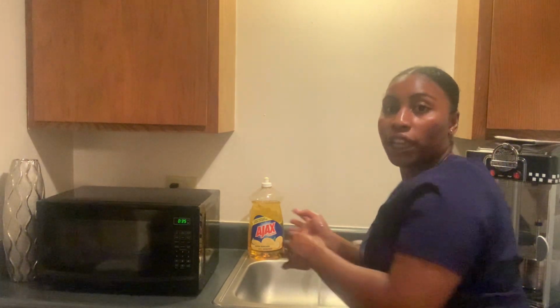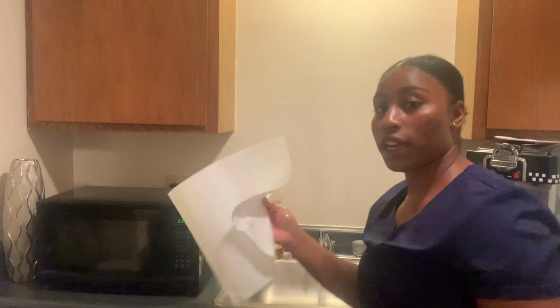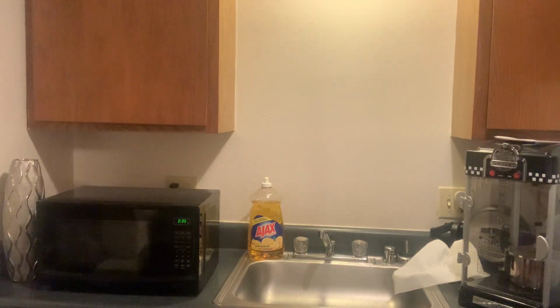Okay, so I'm going to get another paper towel, and I'm going to turn off the faucet. And then I'm going to dry my hands. So that is it. Next step, we put on our gloves.